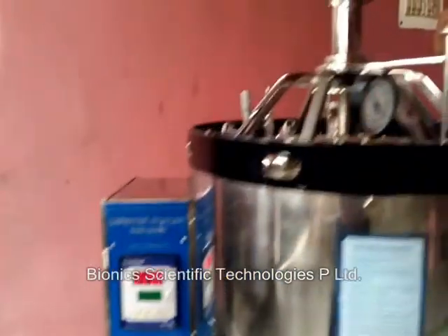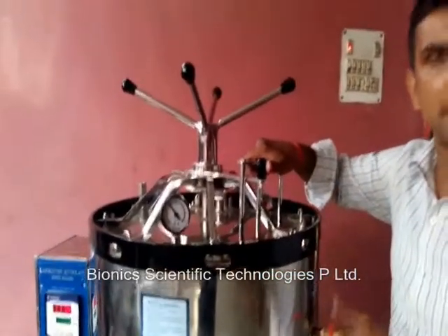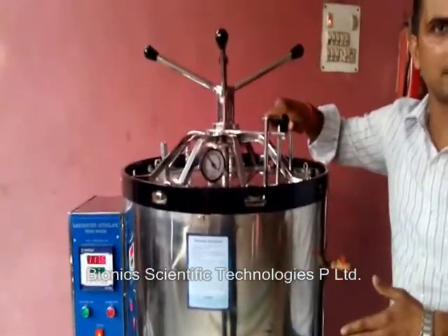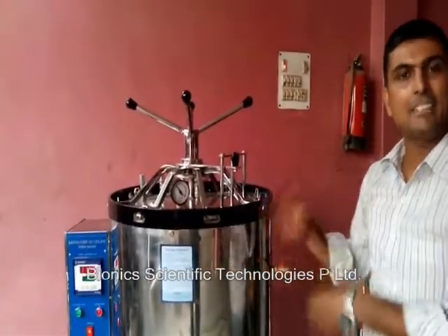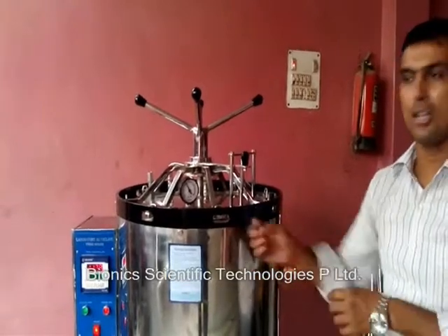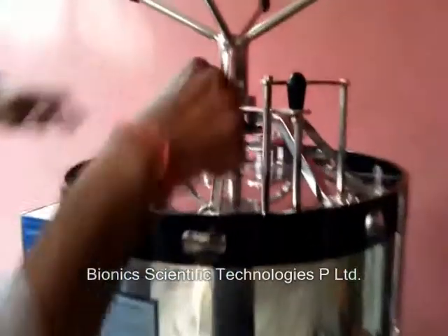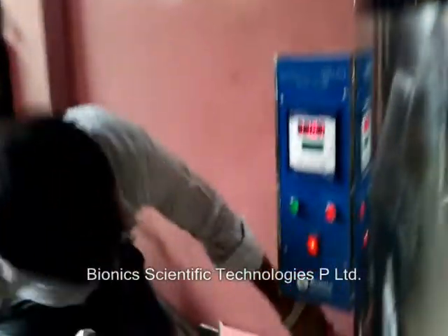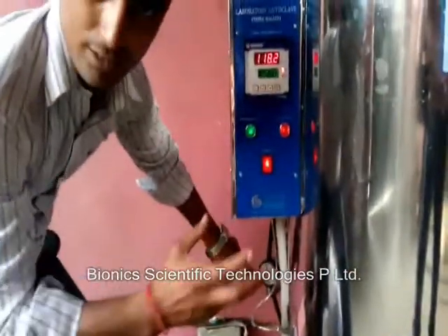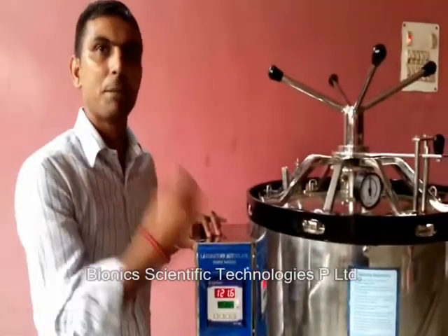Now the machine is in sterilization mode. You can see the pressure is rising on a regular basis and the temperature is more than 100 degrees Celsius, so it is in the sterilization state. It has started killing bacteria, pathogens, and all — whichever is in the sample. You can see the pressure is increasing here; this is the main chamber pressure and this is the main chamber temperature. This is the pressure of the boiler — or we can say the jacket.